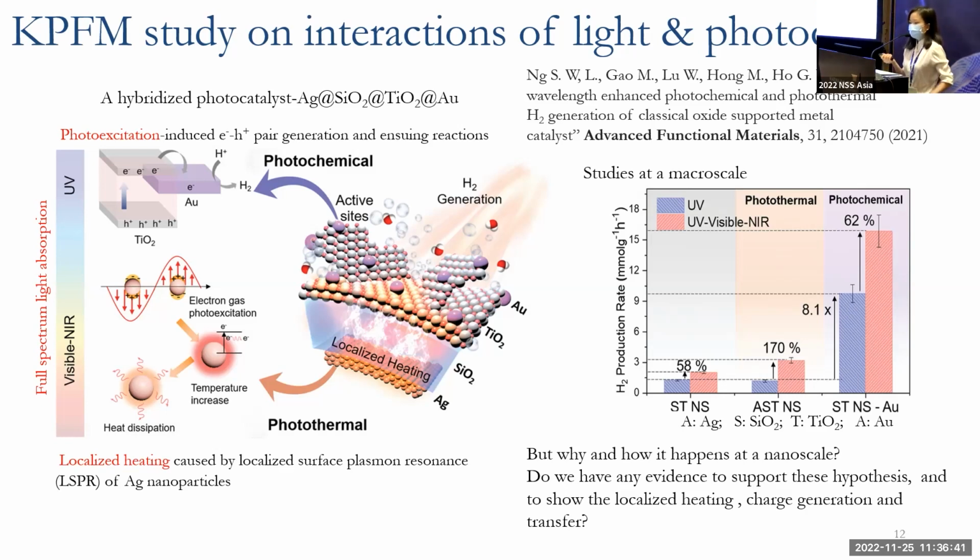Okay, this hybrid photocatalyst has full spectral light absorption and exploitation.